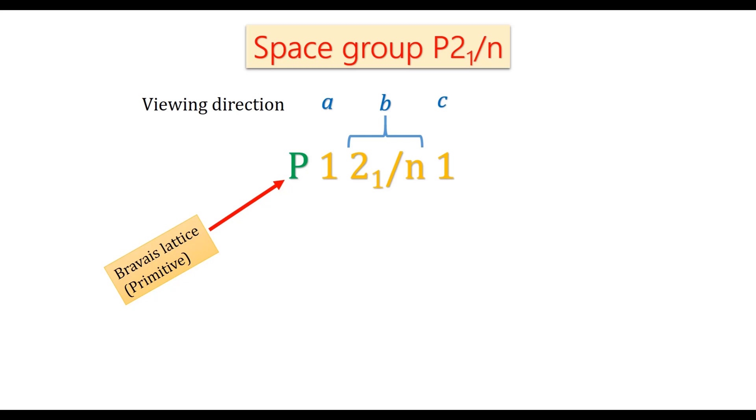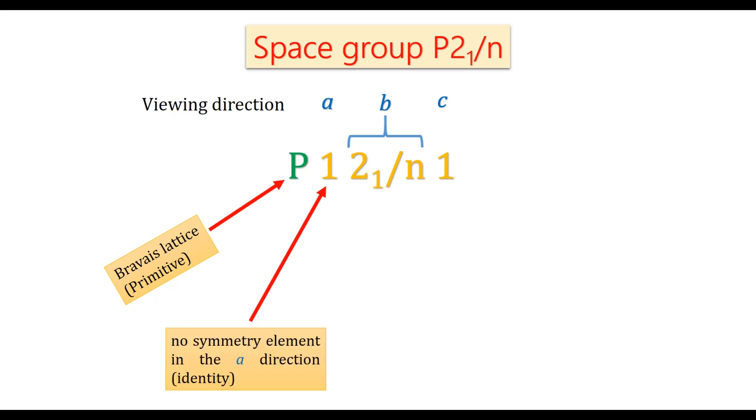So along the direction a, I have written letter 1, meaning no symmetry element in the direction of a, meaning identity.